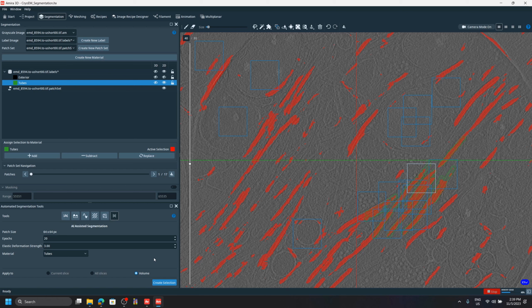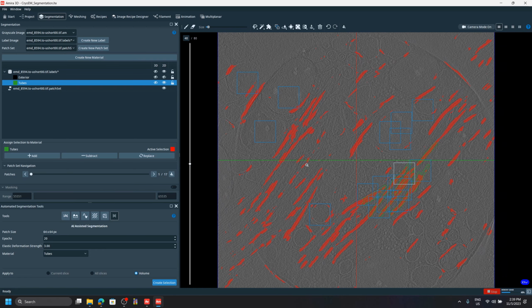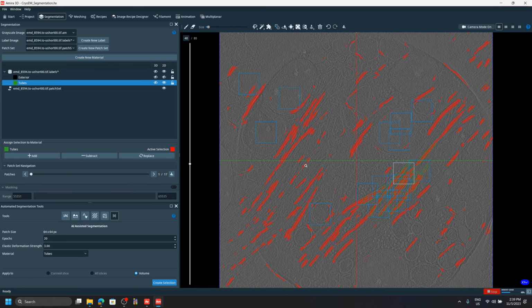So this is the result, and it's not super good. I was kind of expecting that. Yeah, it's missing a lot of stuff, but I think my annotation is pretty bad. But you get the idea, right? Obviously, the better the quality of your training data, the more chances of getting good results.